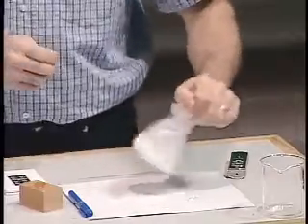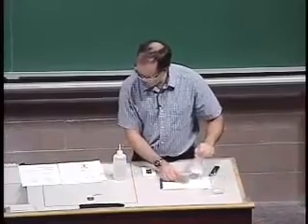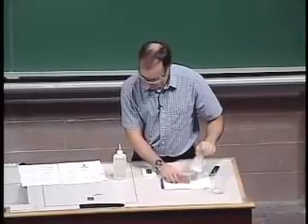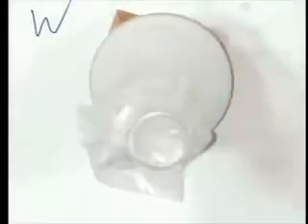So as this reaction proceeds, remember that we were releasing 2 moles of ammonia and 10 moles of water for every mole of barium hydroxide. Very endothermic. So I've got this little block of wood here with some water on it. I'm going to show you how endothermic it is by putting this, that's all mixed up. It's a nice slurry now because all that water has been released. And I'm going to stick it on that block, and I'll come back to that in a moment.